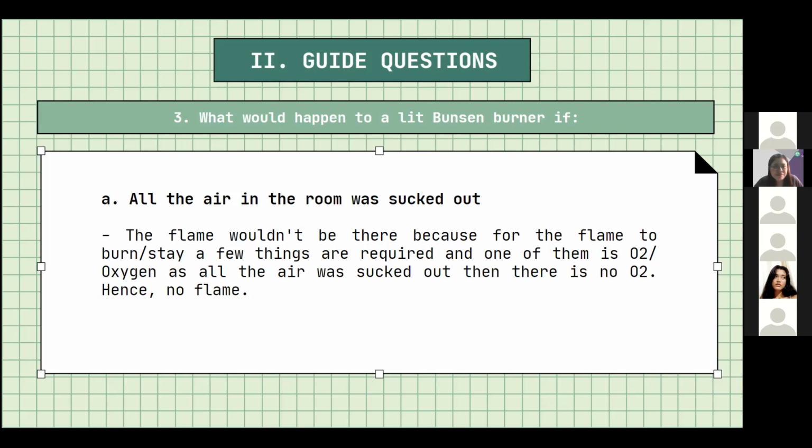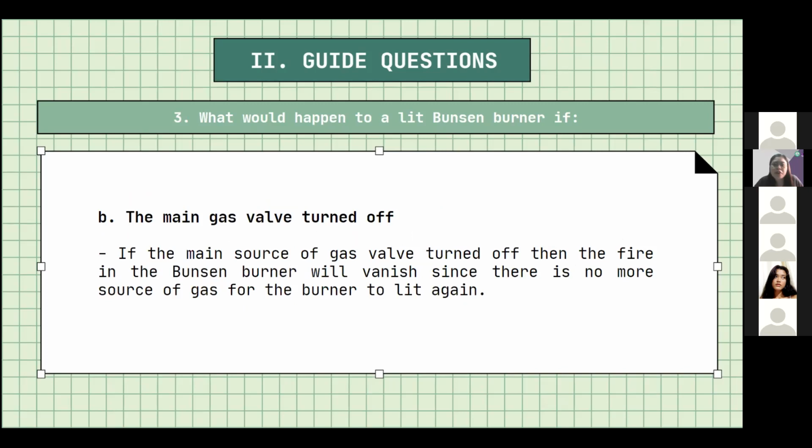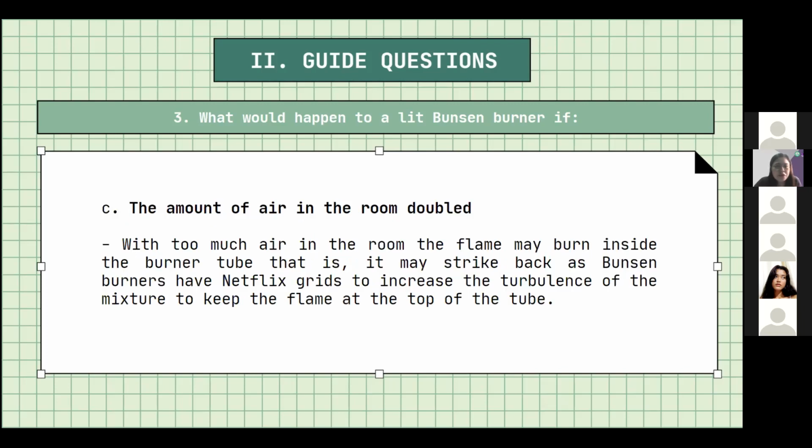Okay? Next. So, the main gas valve turned off. Wala ding flame class kung turn off mo yung gas valve, yung source natin sa gas. So, remember our reaction for the combustion reaction, aside from the oxygen, you have to have a gas source. So the gas source there is a carbon-containing substance like butane. So 'di ba pag nagluluto tayo, we have butane and wala tayong flame na mapoproduce niyan kung wala tayong gas source. So, parehas lang yan kung nawala yung oxygen. No flame din. Next. The amount of air in the room is doubled.